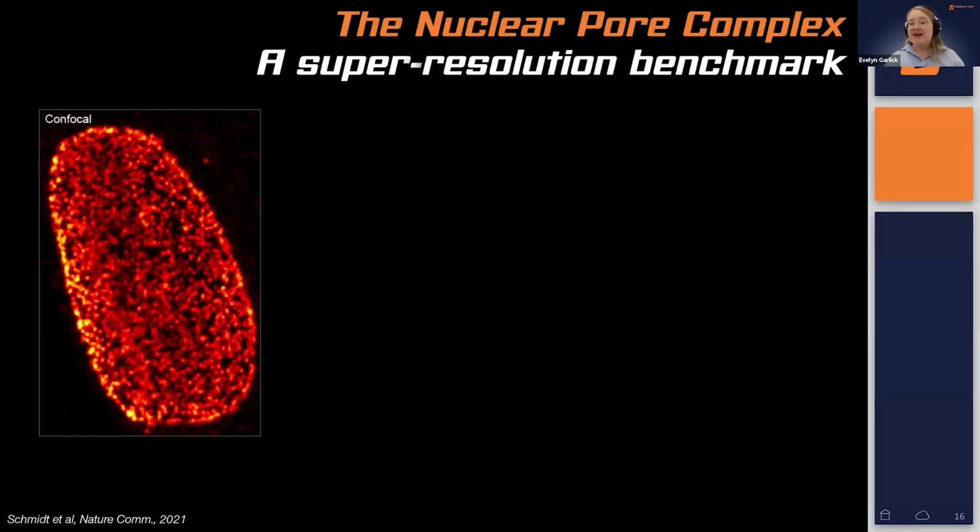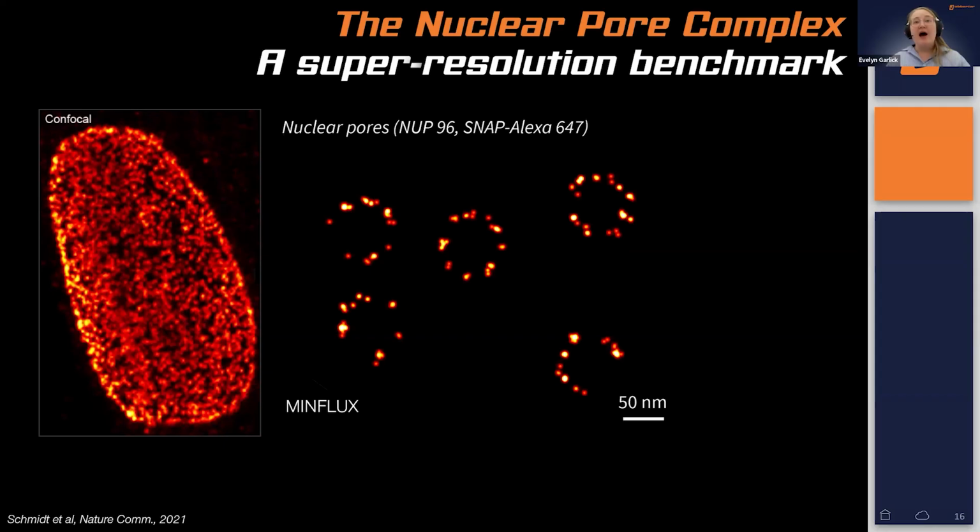So what's on the system right now is a U2OS cell line, which is constitutively expressing GFP-NUP96. And as Xiaoyu showed you, we're able to resolve each of these subunits in an 8-fold symmetry. This was from the original paper where we described the implementation of MINFLUX that we use for our Abberior system, as opposed to the initial invention.